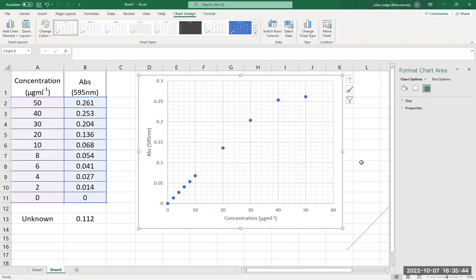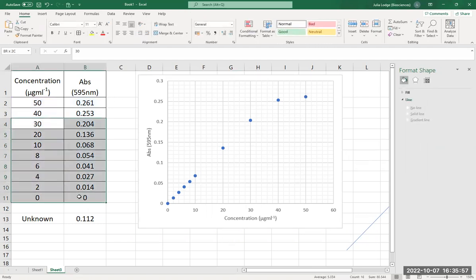Now, if you're drawing your graph by hand, that's fine. You can just get out your ruler and draw that straight line in. But if you want to do it in Excel, you have to be a little bit clever. In fact, what we want to do really is to plot just those points, the ones over the region where the relationship gives a straight line.